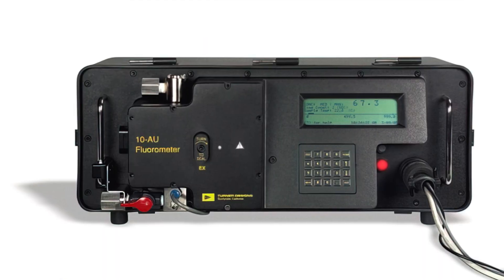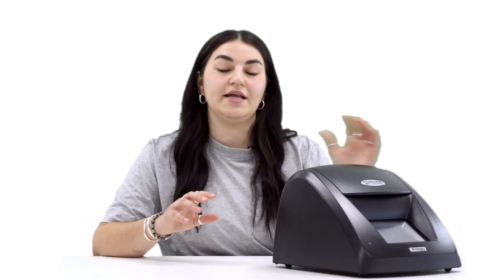The Turner U was discontinued after nearly 20 years of use, due to parts no longer being available. The Trilogy isn't a direct replacement of that, but it is now the only laboratory-based unit that Turner Designs sell.